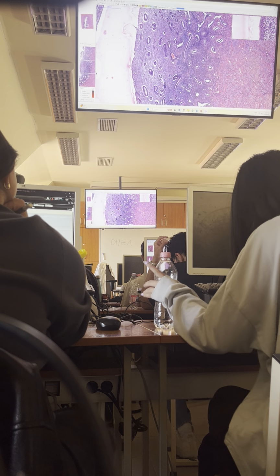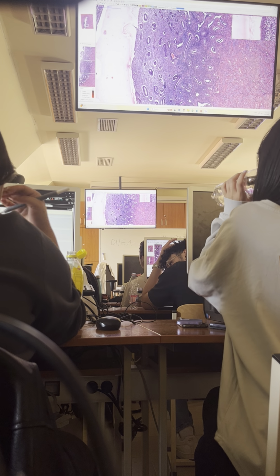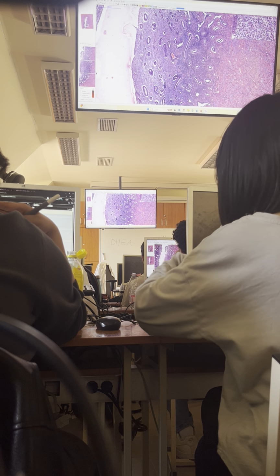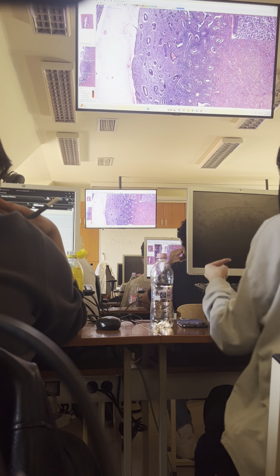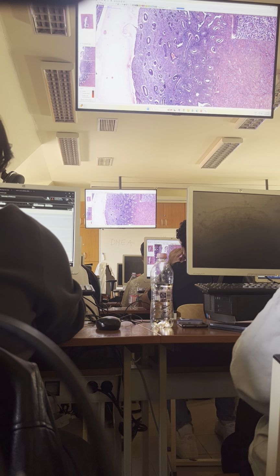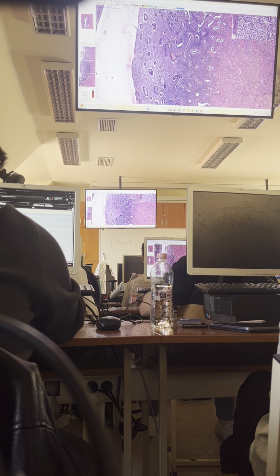Why is it important biologically in your opinion? No, not really. Protection against what? It could be, but well, this is the uterus, not the vagina. In the uterus, it is not so natural to have a microbiome. It is natural in the vagina. So, something else.